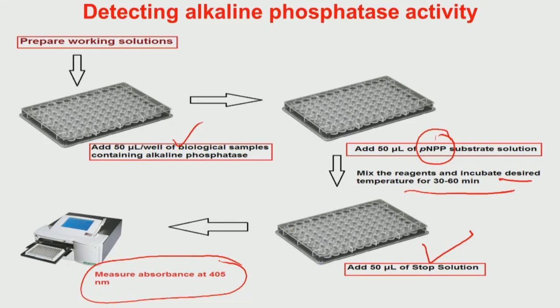Third, for what kind of purposes you are measuring, and what the origin is for all these assays, like whether it interacts with specific organelles or whether a certain enzyme is leached out of the cytoplasm of a cell and so on. Once you know sufficient background of each and every assay, only then will you be in a position to analyze and interpret the different values coming out of all these assays.